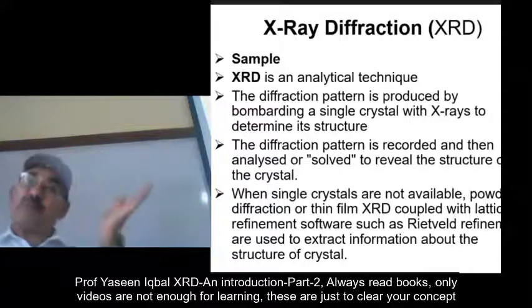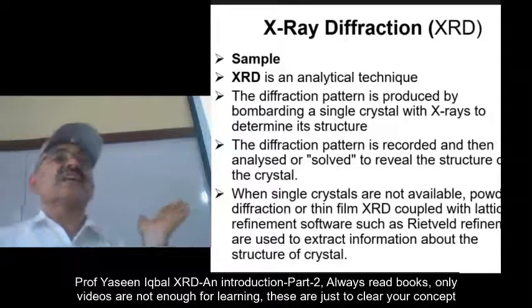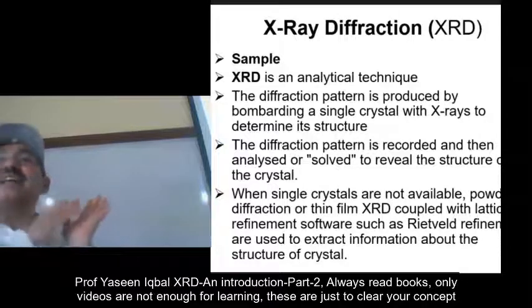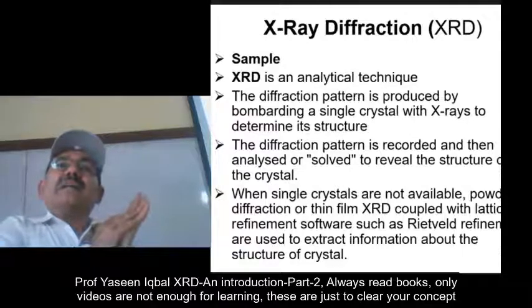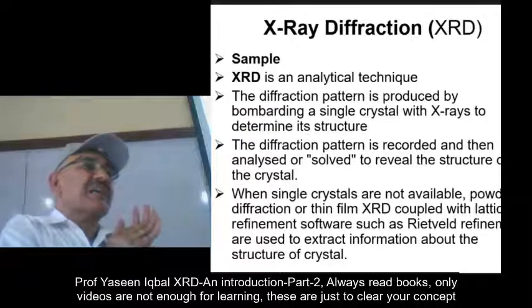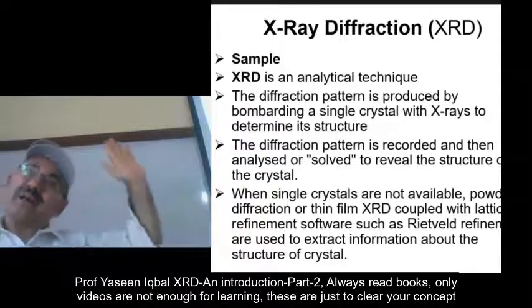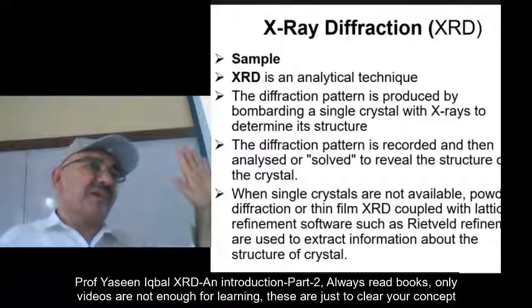So when you put a solid sample inside, and the material's crystals have a preferred orientation, they are not randomly oriented inside the solid sample, then they are giving you misleading results, because they are giving more intensity due to that specific plane in comparison to the others.